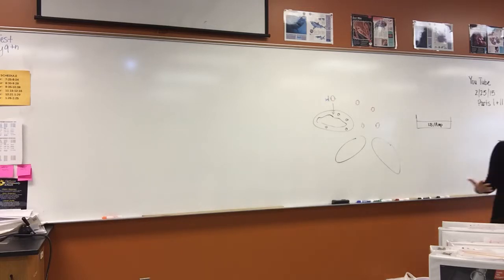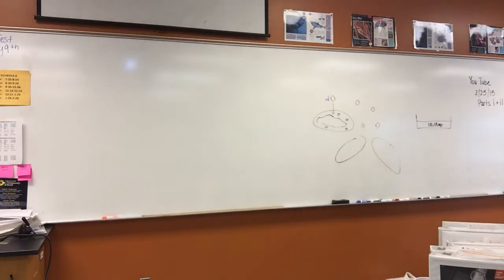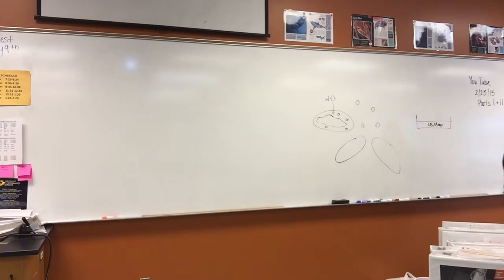We're going to do the transformation part, where we're going to expose E. coli bacteria. We're going to use bacteria that is not harmful, from a company that supplies it for use with students. Although we're not going to open the Petri dish and touch the bacteria, okay? But it's not a harmful bacteria. We're going to do this transformation process and try to get bacteria to take in the recombinant plasmid. So if you look at your procedure sheet, I just want to talk a minute about what the company did before we got this plasmid.